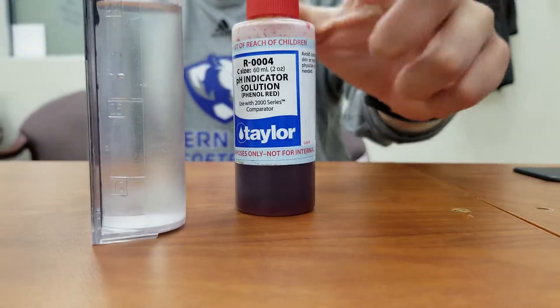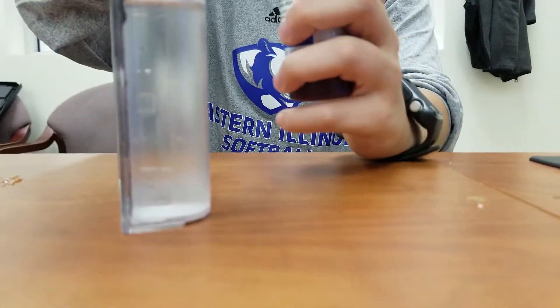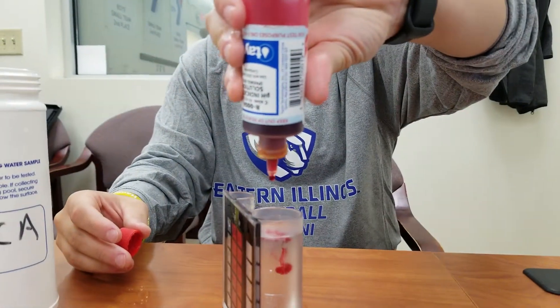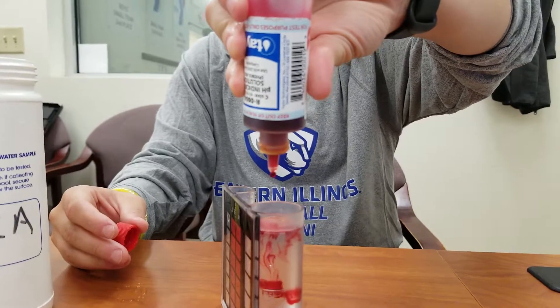We're going to take five drops of reagent R004, the pH indicator solution. We want to make sure we keep the reagent tube straight up and down; turning it slightly to the side will mess it up.